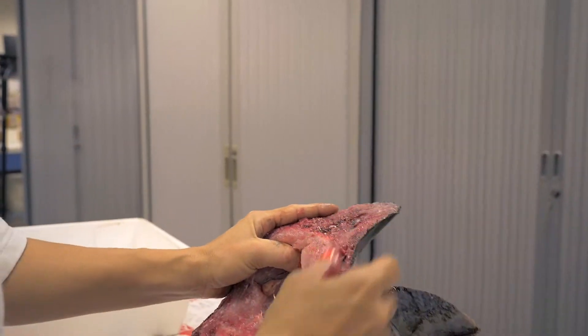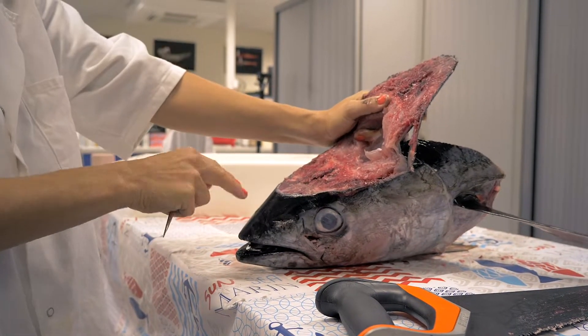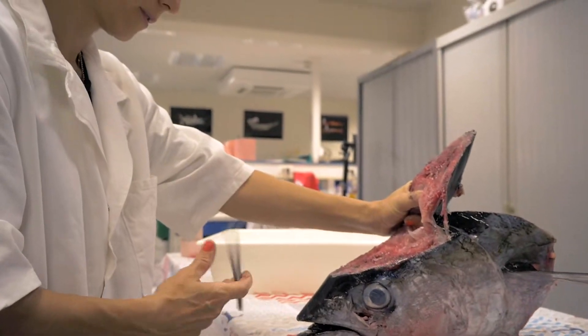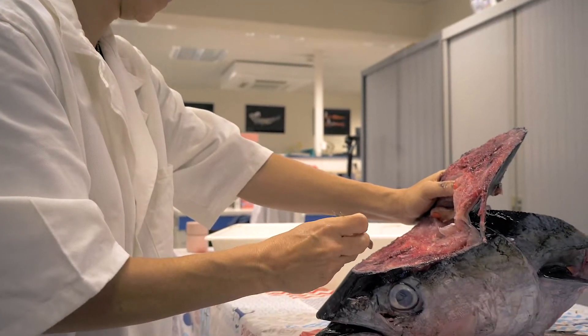If you don't cut deep enough, you can then make another cut to go deeper. Now the top of the head is open. I'm going to place the head so it's facing towards me. Now I can look into the eye of the fish. This is important because it is easier to find the otoliths like this.